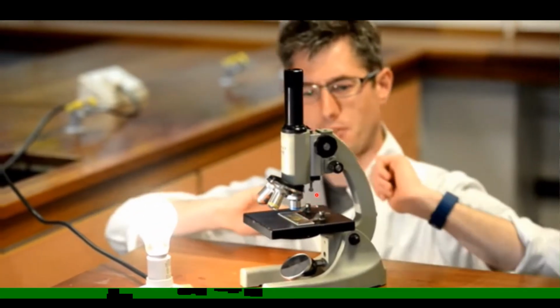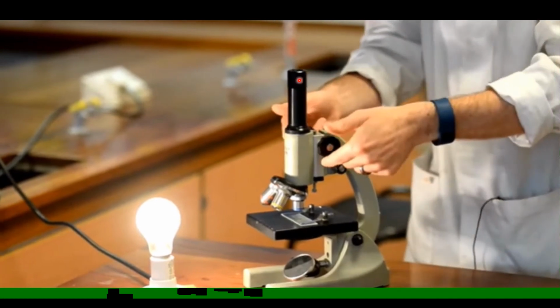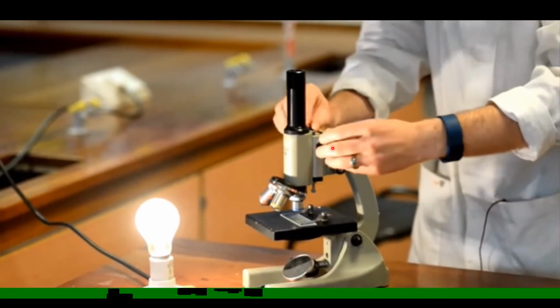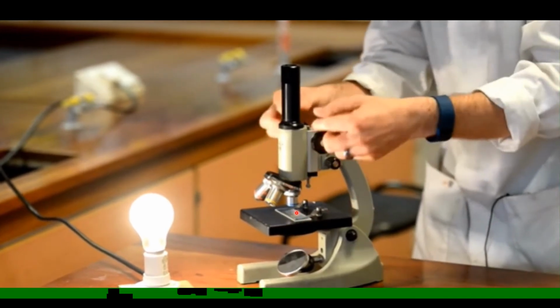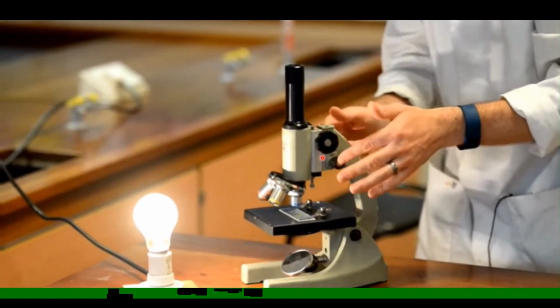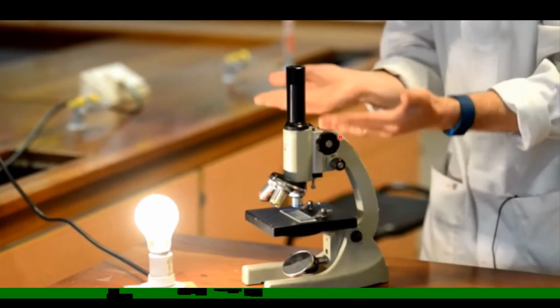You have to bring the lens much closer to the specimen. Then you have to keep your eye on the eyepiece and observe a clear image of the specimen by adjusting this rough adjustment knob or the coarse adjustment knob.